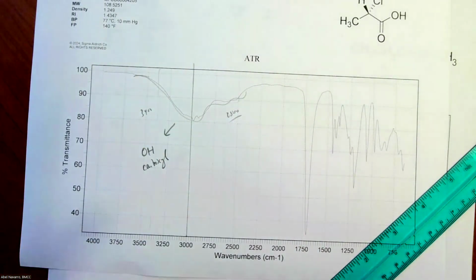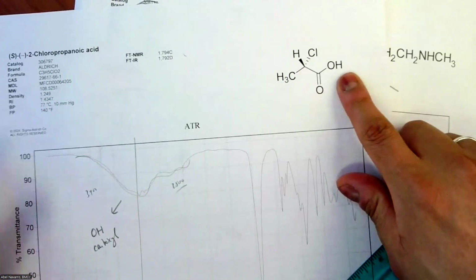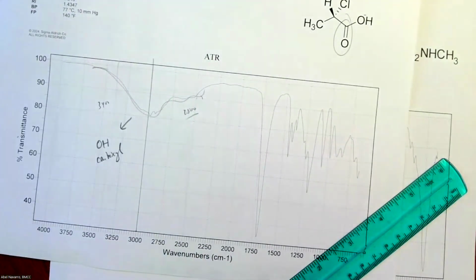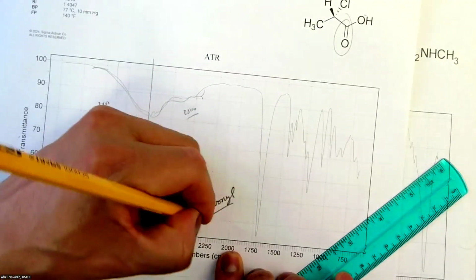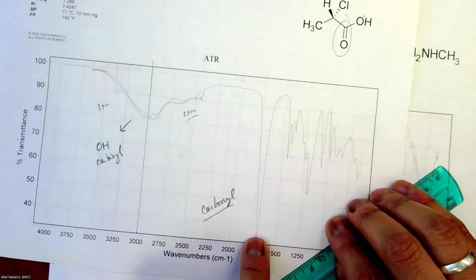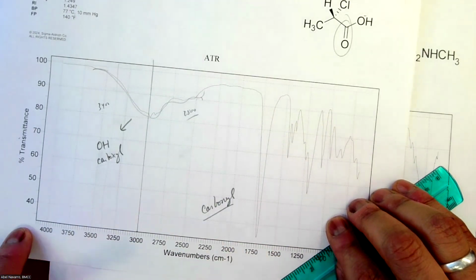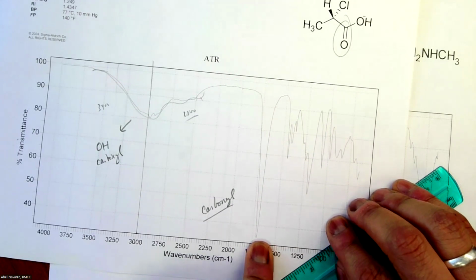To me, this one is a hint that I might have a carboxylic OH. How do I confirm that? I can confirm that by the presence of a C=O. Why? Because the carboxylic acid has the OH, but also has a C=O. So the C=O is this one, and that's a good introduction for the C=O, or carbonyl groups. Some people say carbonyl group, so it doesn't really matter. The carbonyl group is really intense, with a medium width. It's not sharp, it's not broad. It's a medium width, but it's really long. I have seen it go all the way down to even 10% or even 5%. So it's really strong.